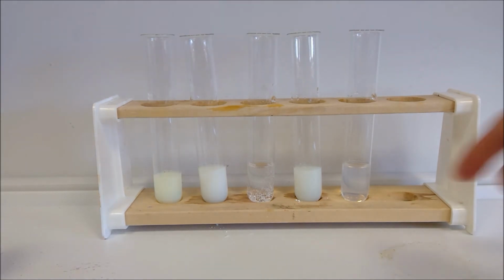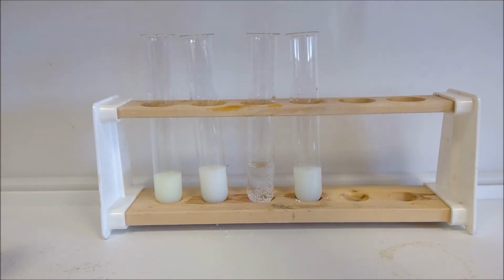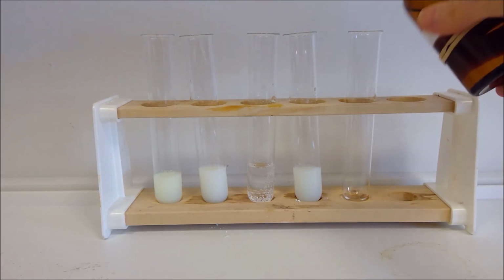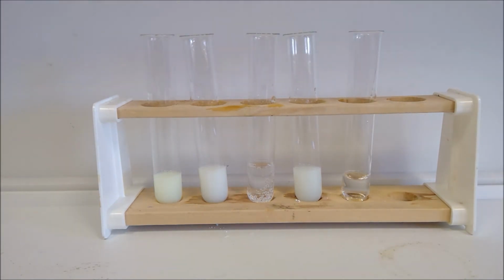And then our final test, we need to keep having a look at solution 5 and decide what's in this one. So I'm going to remove that and put a fresh sample of solution 5 in here. And now we need to test for the presence of sulfate ions.